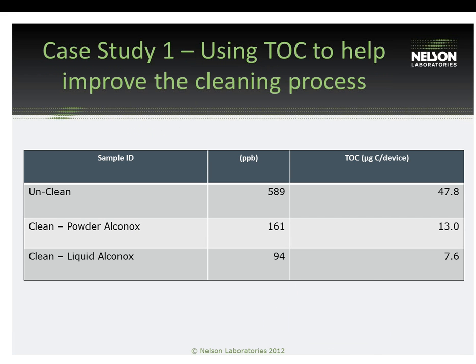And so, we're nearing the end of this presentation, but I wanted to include maybe 2 case studies with some numbers of what we've been discussing today so you can see better what we're talking about here. In this first case study, this client was using TOC to help improve their cleaning process.